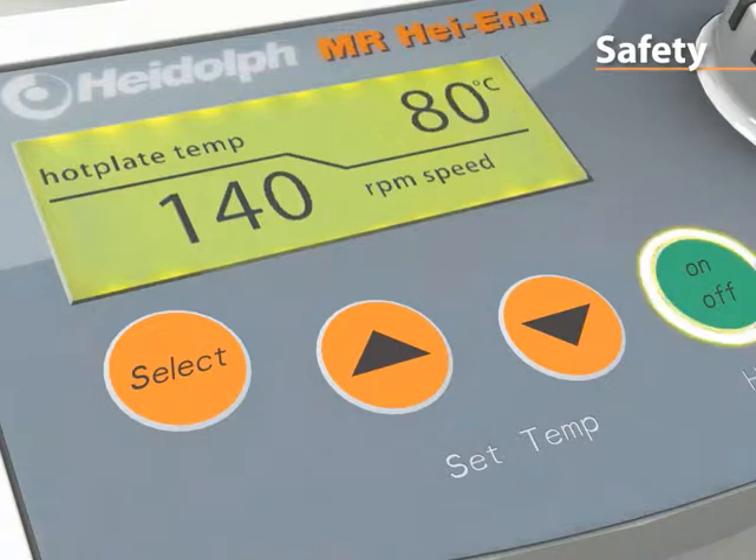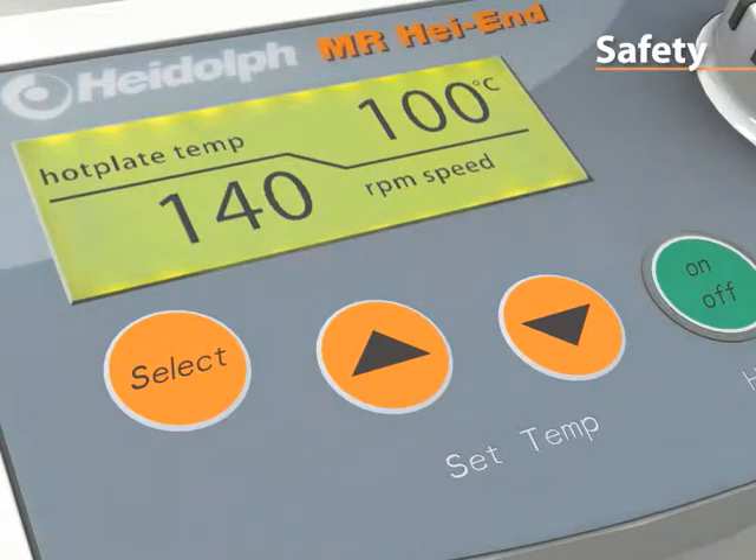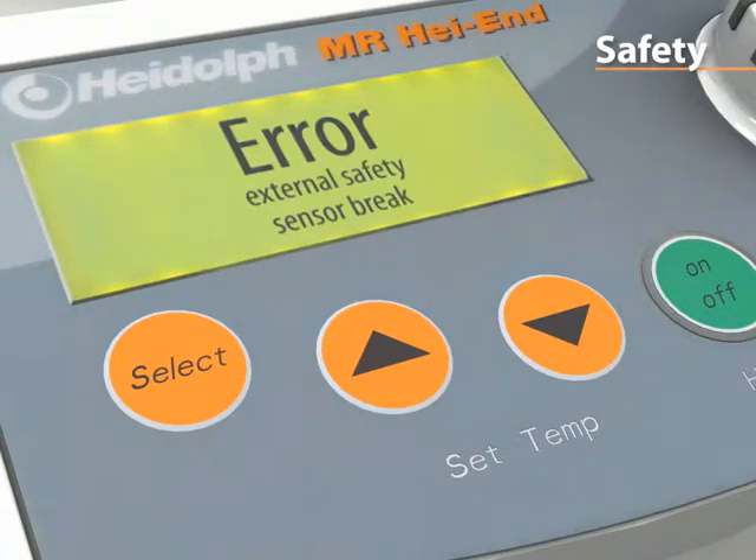An overheating circuit switches off the hot plate if overheating occurs. The unit will power off in the case of a short circuit, damage to the temperature sensor, or a motor failure.